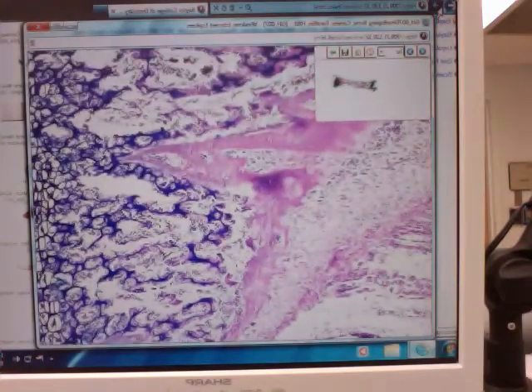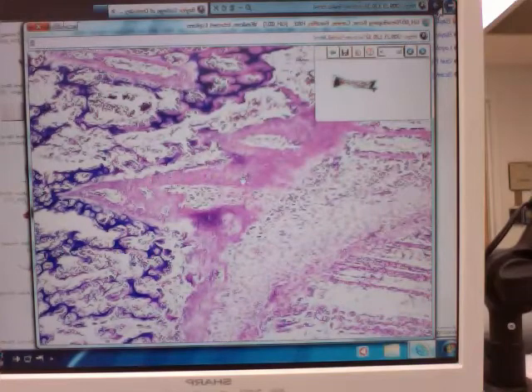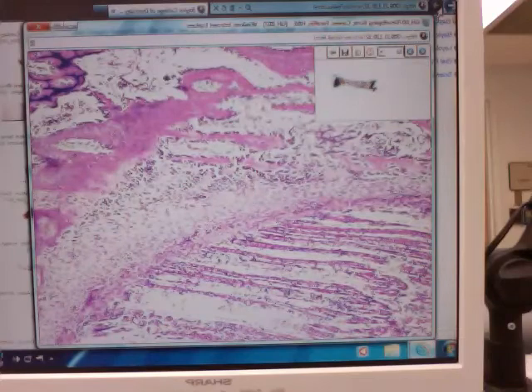And even though we were describing this as woven bone, we're starting to see this newly formed bone, so it's got to be woven bone. Even this stuff out here is woven bone. It's newly formed bone that hasn't had the chance to be degraded. It's just been made. You haven't already come in and remodeled it, degraded it. This is still woven bone in this area. And it's not till you get out further where you can actually see the lamellar organization that you know you're into secondary and mature bone.